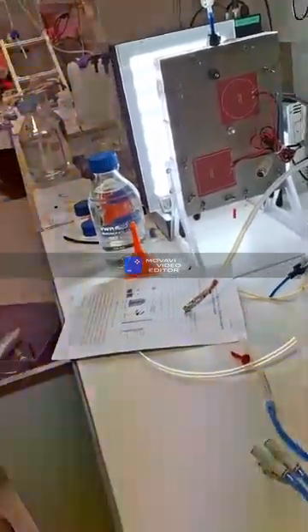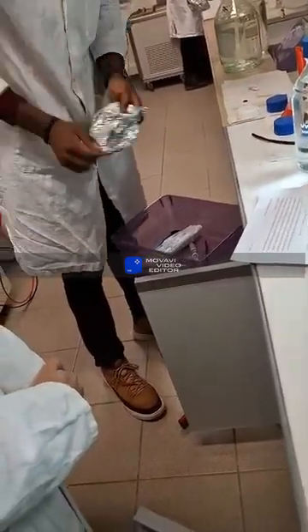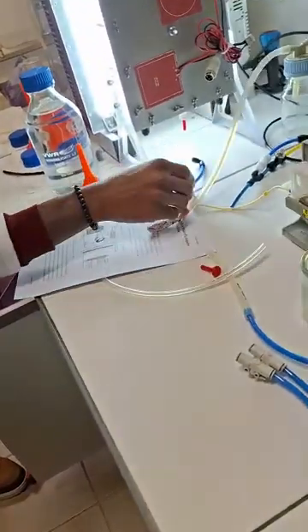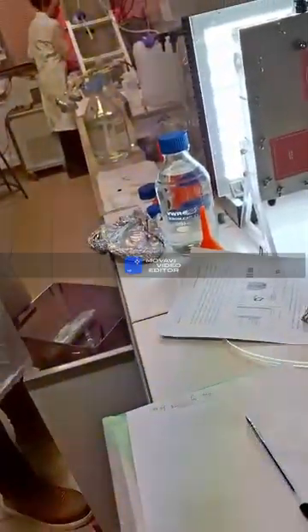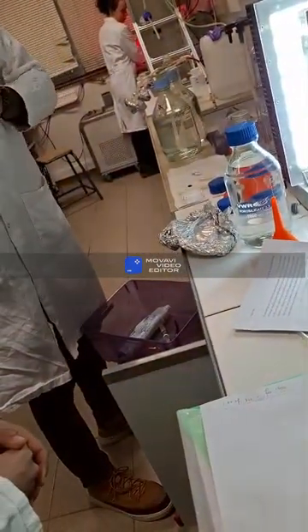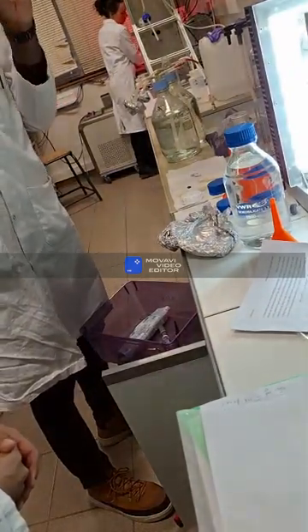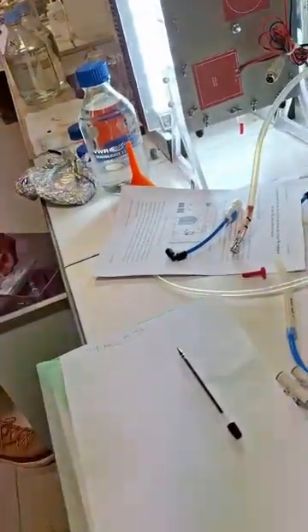And here you have some pipes, and here, for example, you will plug it there. It's a quick release. For example, you just have to push, and after you have to push this ring to put it up. So we will need three like this.